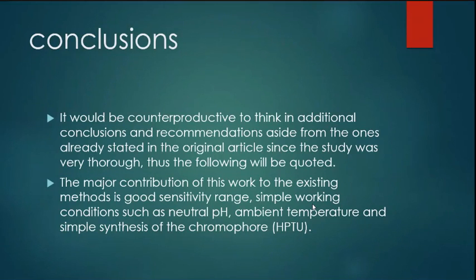And the paper says, literally, that the major contribution of this work was the sensitivity range, as you saw in the graphs, and the simple working conditions, because you saw that it was a neutral pH and room temperature, which will be very good for costs and other variables that may be in the game, to say it in one way or another.